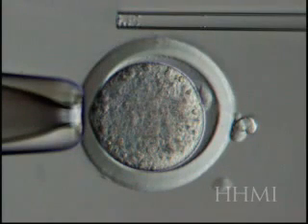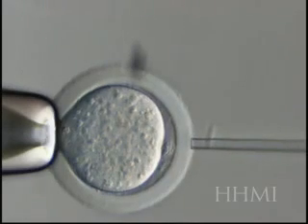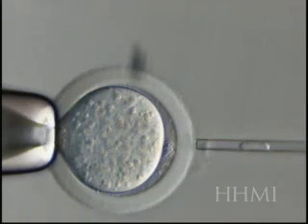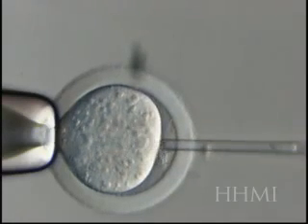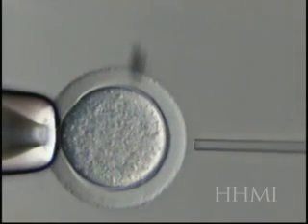Now the next step is to take a set of eggs like that — I'll show you two — and then transfer into them a nucleus from another kind of cell, a fully differentiated somatic cell. Here the enucleated egg is set on the side and it's held by the holding pipette on the left. There's drilling the little hole in the membrane. Here we go in, and here comes the nucleus from the right. The pipette goes in, and these pipettes are operated with a piezoelectric device — it's like a little jackhammer going very quickly, like Woody the Woodpecker — getting in there to then squirt the nucleus in.